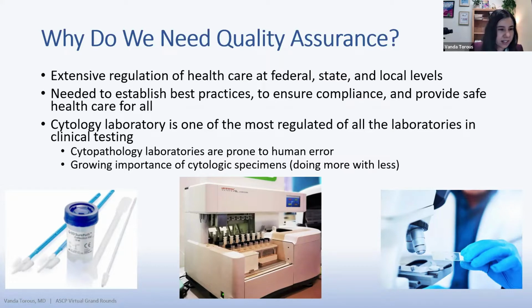And think about how many different types of specimens we actually receive in the cytopathology laboratory as well, and how processing and testing may vary depending on a lot of different factors. So there's just a lot of different junctures for mistakes to happen, even more so than surgical pathology.